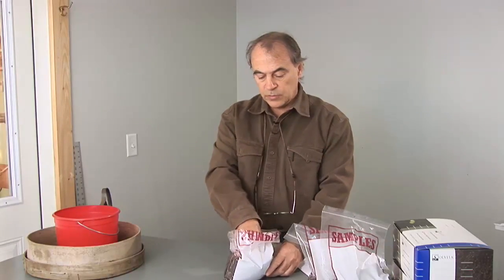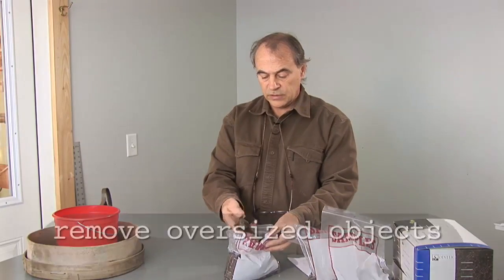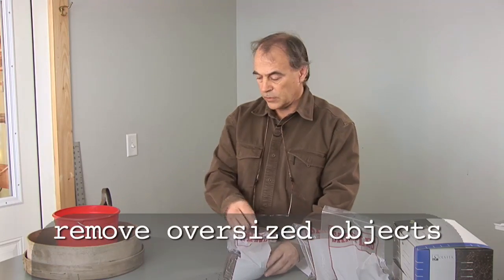Normally it's best to screen a sample before performing the test in case there are large chunks in it. Let's screen it.